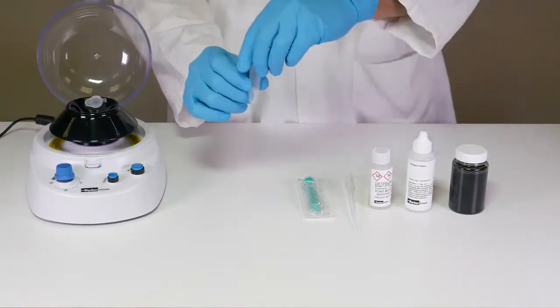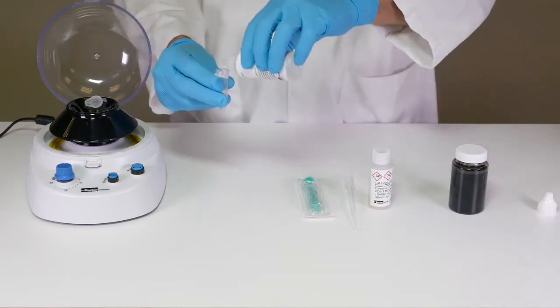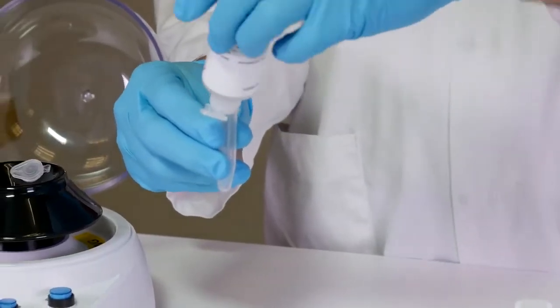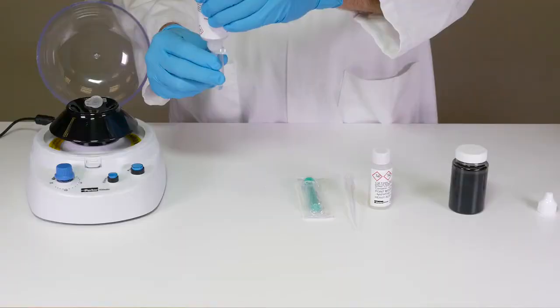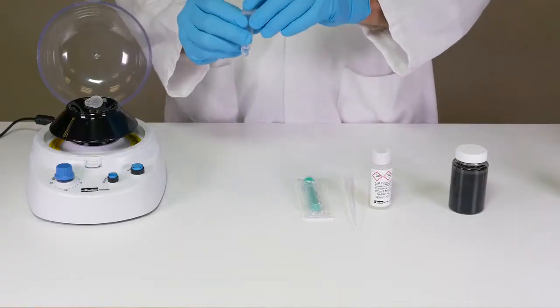Next, fill a second test tube to the 0.5 milliliter graduation line with reagent alpha. Place the tube in the centrifuge opposite the first.